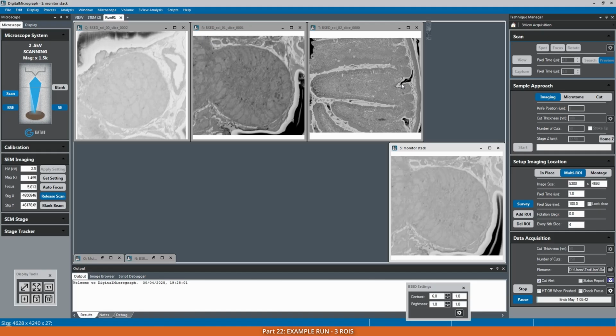And on this V system, it's possible to compensate using the low vacuum mode. And that's the mode we're probably going to use on this sample. Even though it's a tissue, this is a bit challenging tissue because it has a lot of empty space. And in order to image this, we will have to use the low vacuum mode.